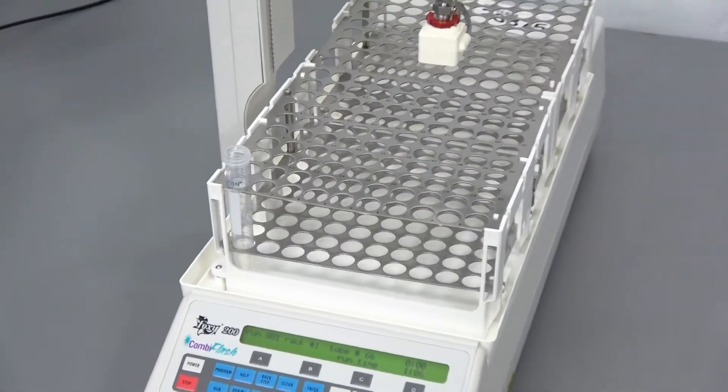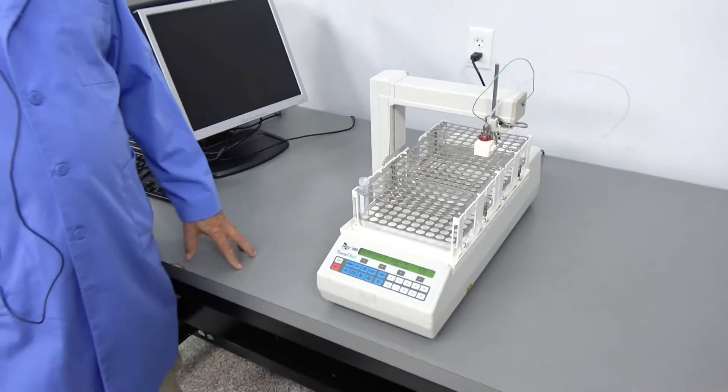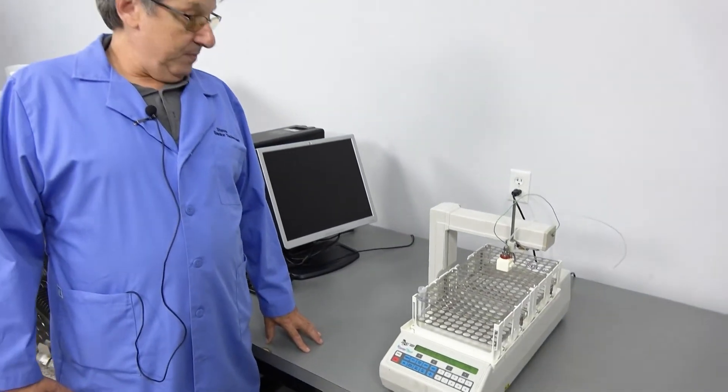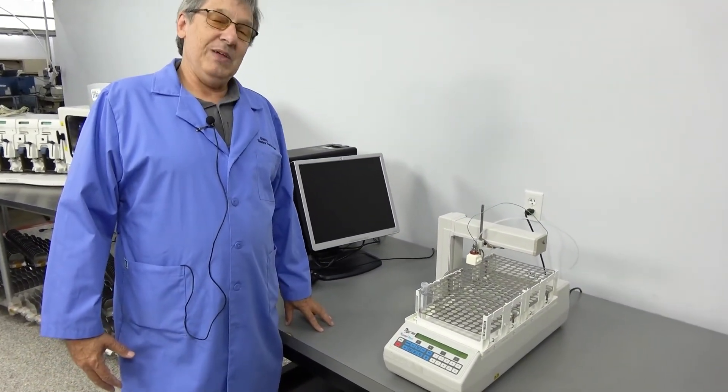The system is going to finish out for us over the time and that's what we wanted to show you today. It will be available on our website soon. Thank you very much.